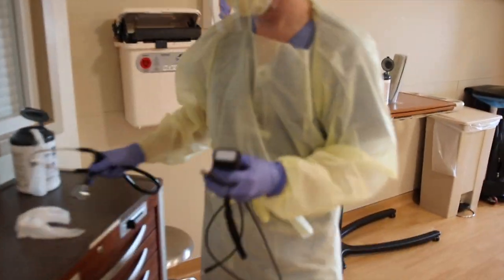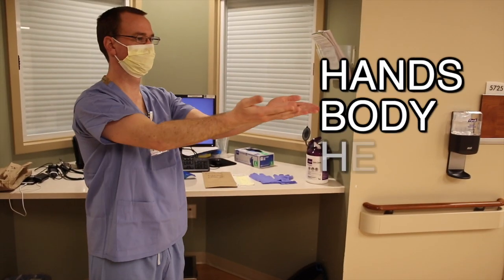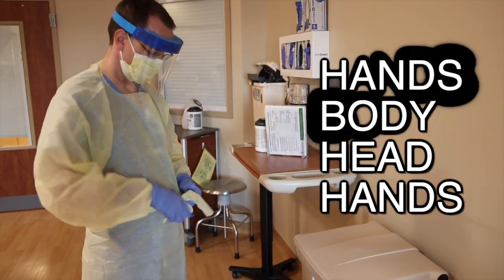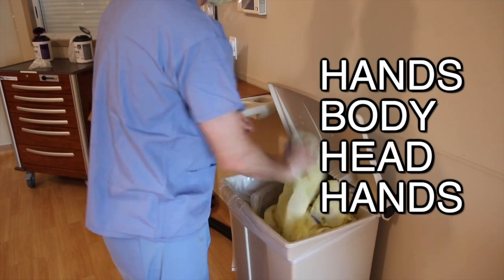Once this equipment is fully sanitized, please place it aside at least 6 feet away from the patient in a clean area. From here, removing your PPE is similar to putting it on, where the order is hands, body, head, hands. If you are using a disposable gown, you can remove the gown and gloves at the same time and put them into the wastebasket.